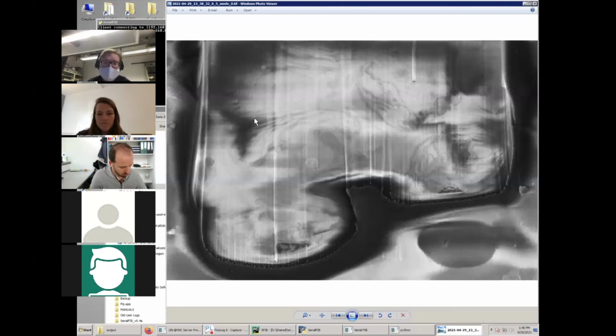in terms of dose. But you have to take into consideration that we're not at 300 kV, but like 3 kV, right? So you have a cross section. Your cross section gets a lot bigger, and therefore you can put less dose on the sample before it starts blobbing because the damage is just higher.